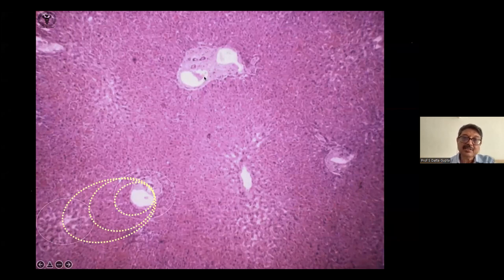And therefore, this actually repeats all over the liver. You have a portal tract, a terminal hepatic venule, a portal tract, a terminal hepatic venule. This will be near the terminal hepatic venule, partly seen, and this will be the portal tract. And there's no separation between one lobule and the other that you see in this. They are almost continuous. So they are divided into lobules or acini.